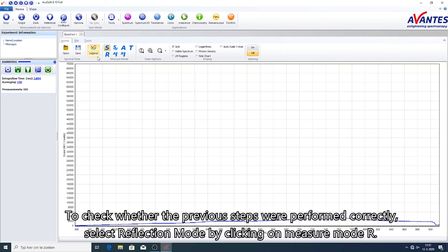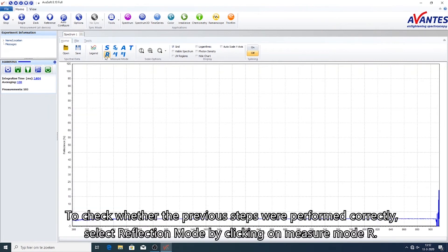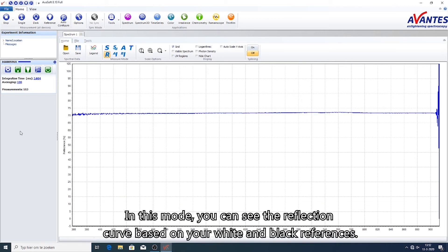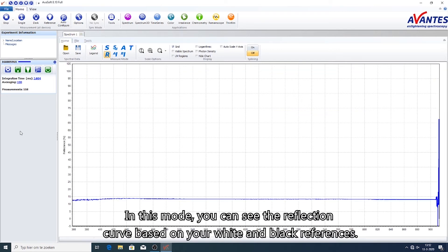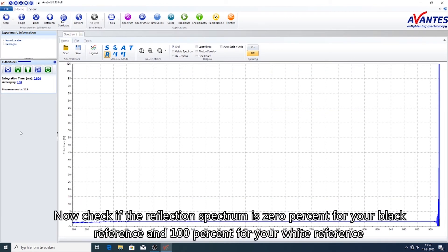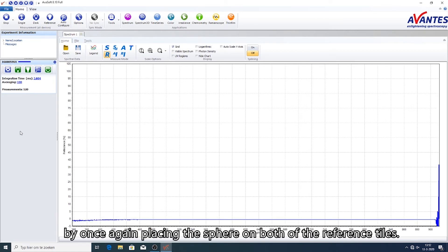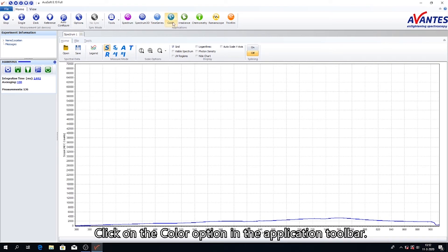To check whether the previous steps were performed correctly, select reflection mode by clicking on measure mode R. In this mode, you can see the reflection curve based on your white and black references. Now check if the reflection spectrum is 0% for your black reference and 100% for your white reference by once again placing the sphere on both of the reference tiles. Click on the color option in the application toolbar.